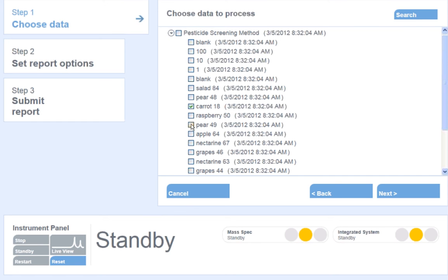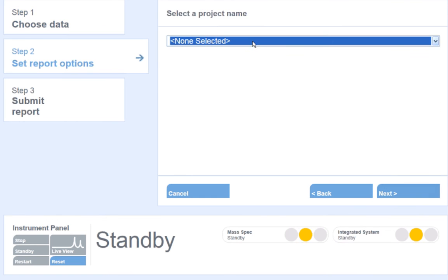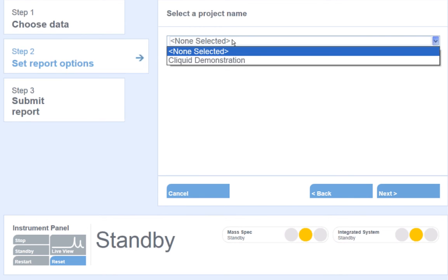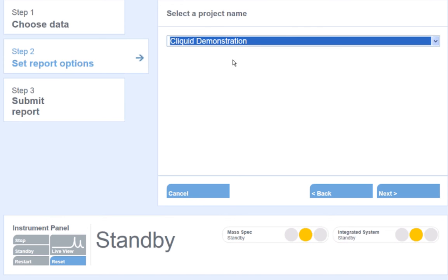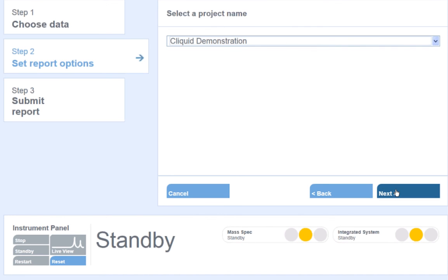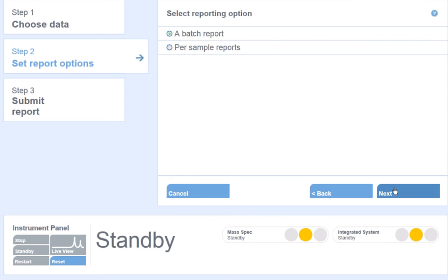In this example, I will choose to process only two or three samples. Next, I will select a project name. Projects are a way to organize our data. Select the project name and the process data will go into this directory. Click Next.